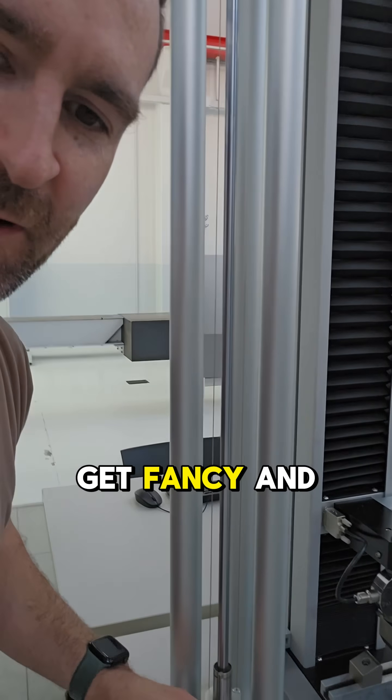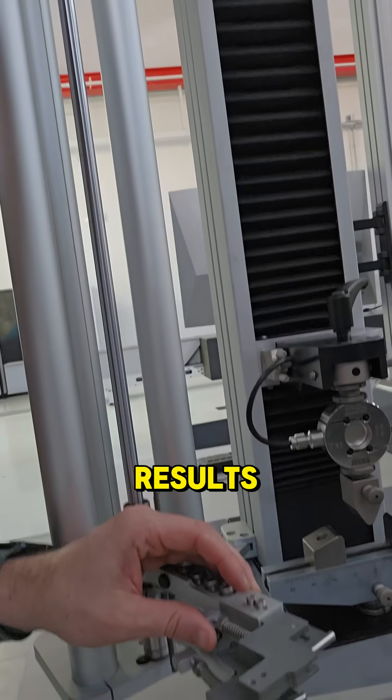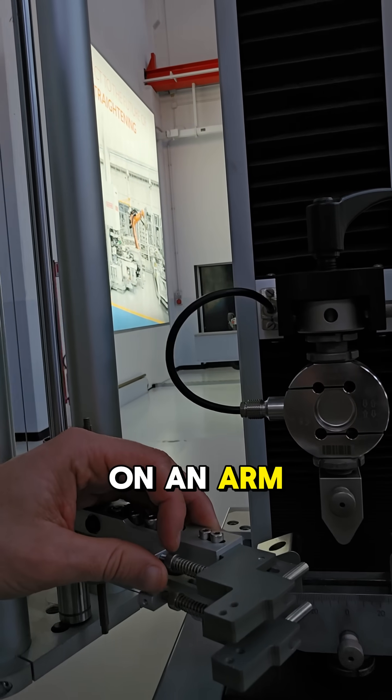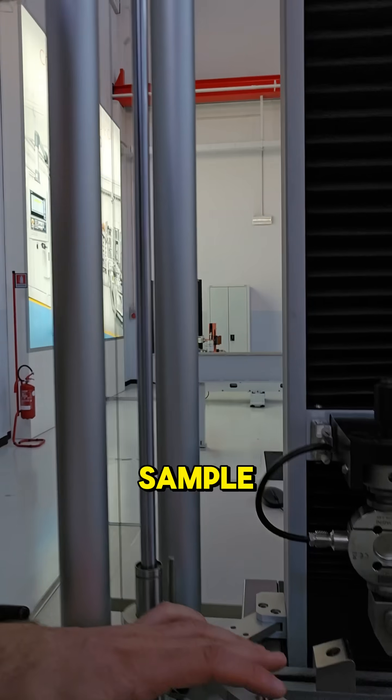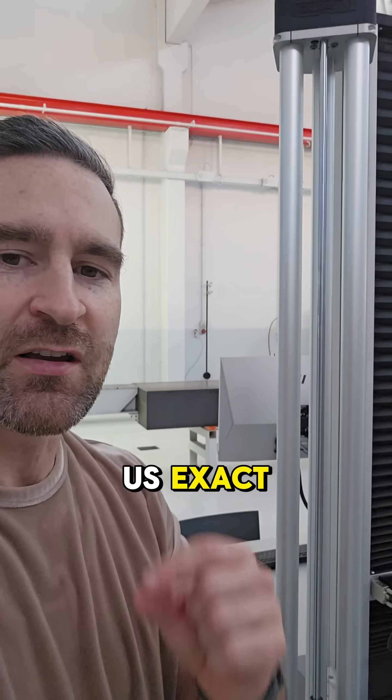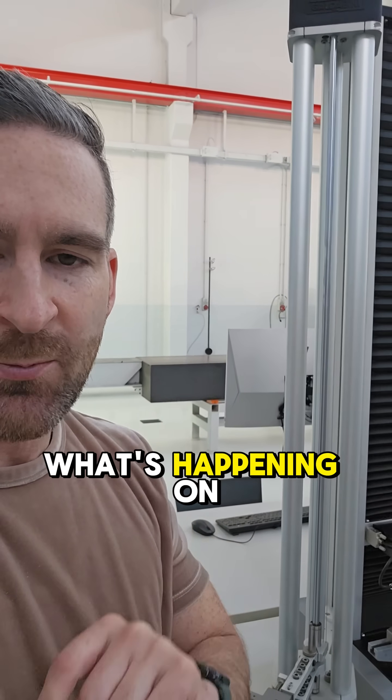And if we want to get fancy and get really good results, we use an extensometer. This extensometer sits on an arm and can fit right underneath the sample. It's also sometimes called a deflectometer, and it'll give us exact strain measurement for what's happening on the sample.